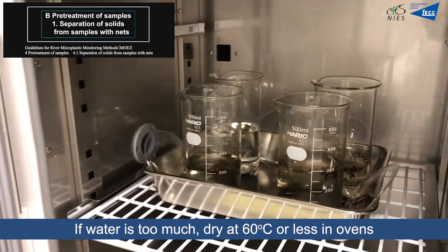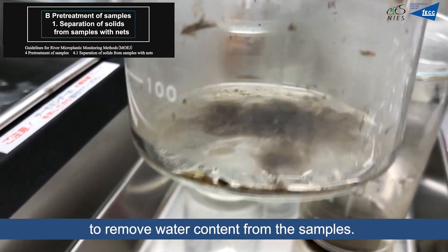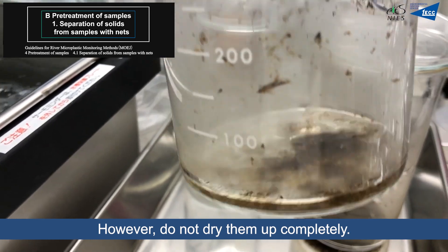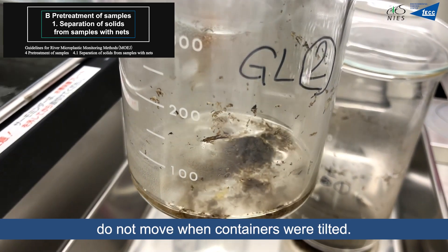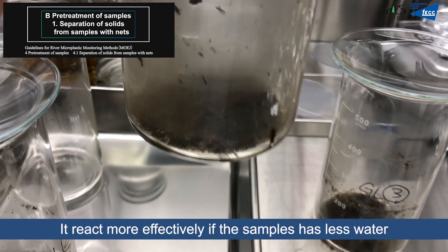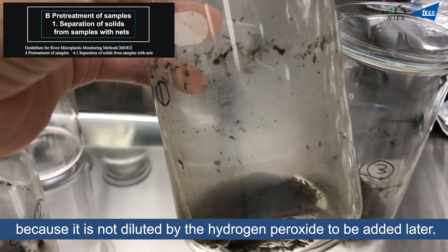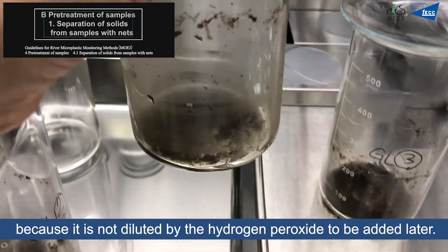If there is too much water, dry the samples at 60 degrees or less in an oven to remove water content. However, do not dry them completely. The best condition is that the wet samples do not move when the container is tilted. The treatment reacts more effectively if the sample has less water, as it will not be diluted by the hydrogen peroxide to be added later.